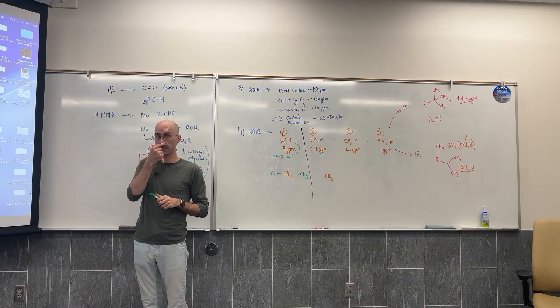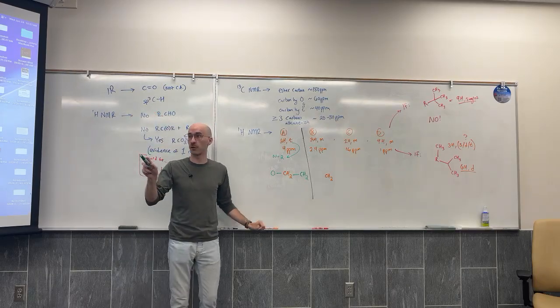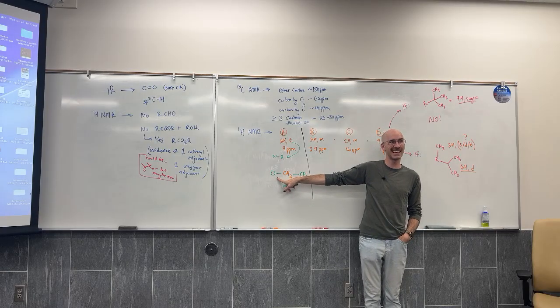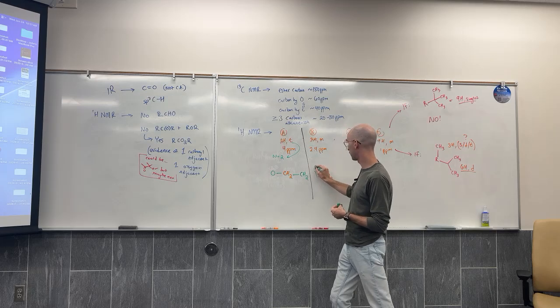I don't know the structure. We're learning it together. I'm getting a little worried. That's okay. Proximity to a functional group, not a functional group as electronegative as just oxygen. Something less electronegative. Since we believe we have an ester, the only possibility there would be the carbonyl.